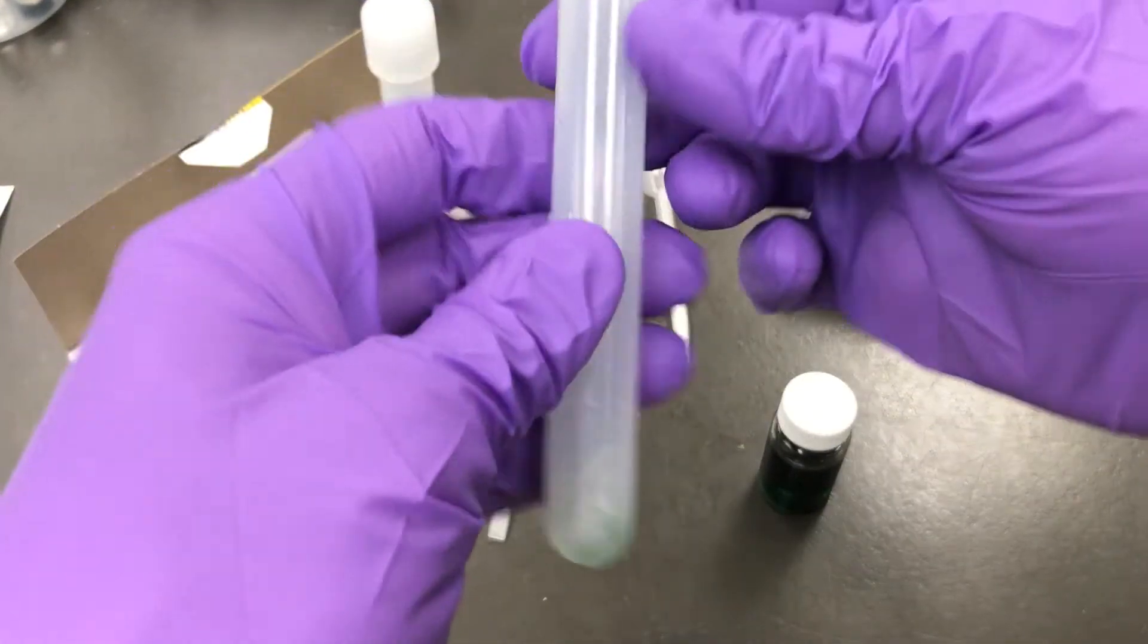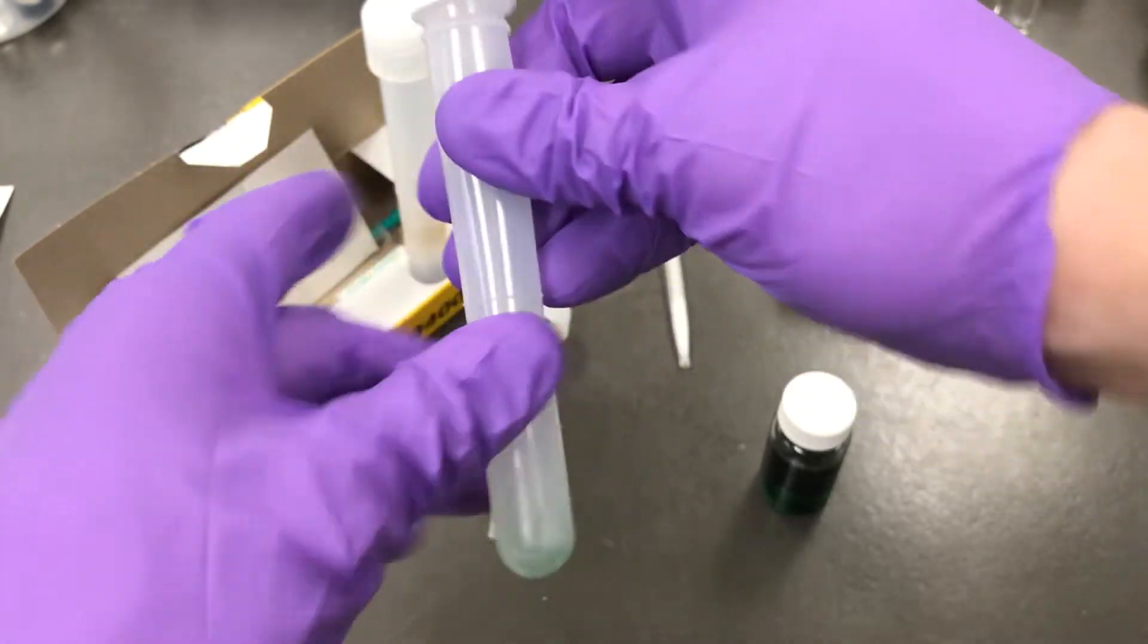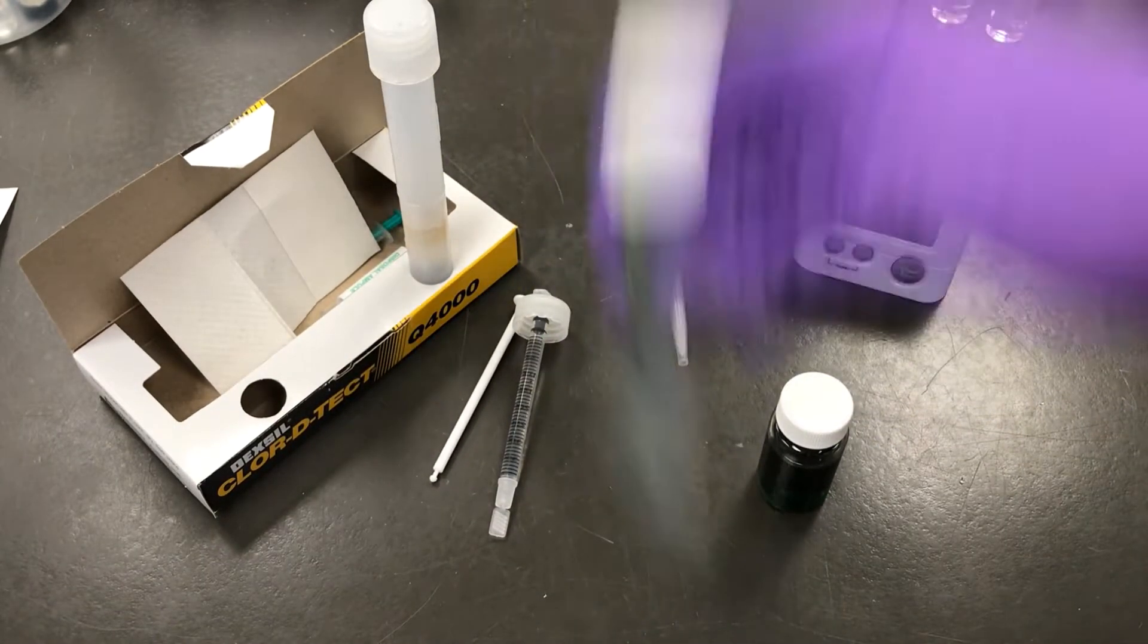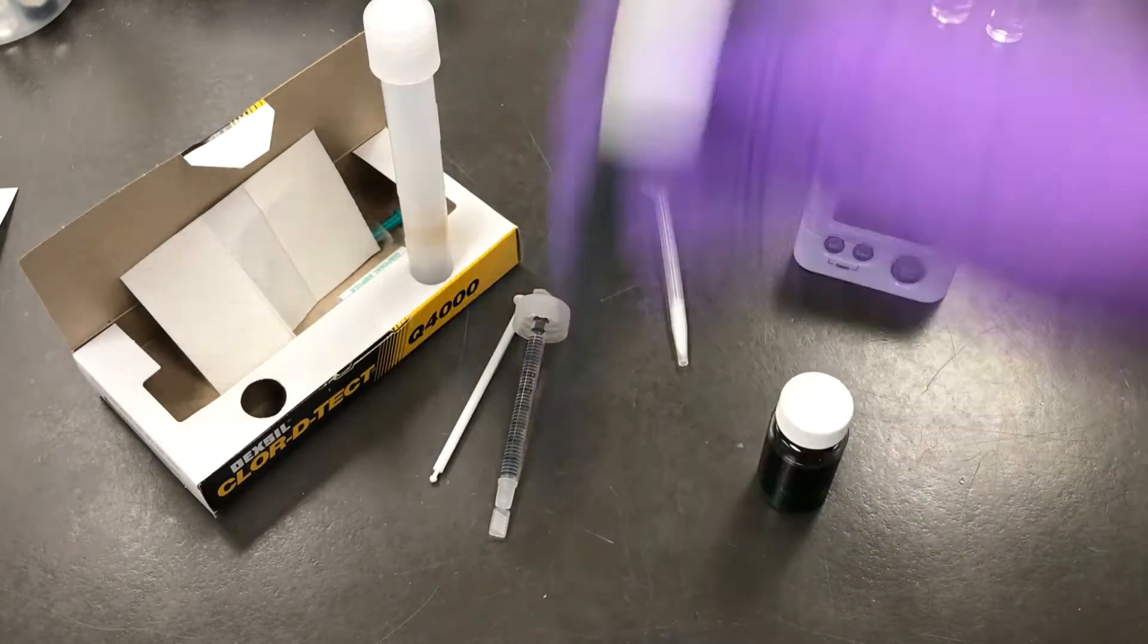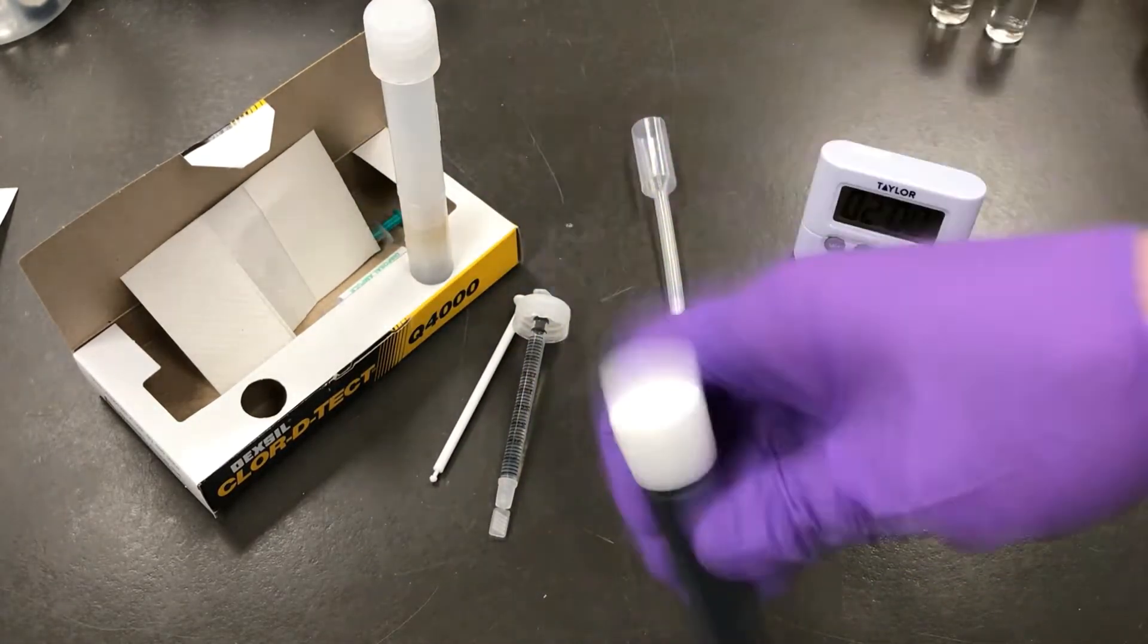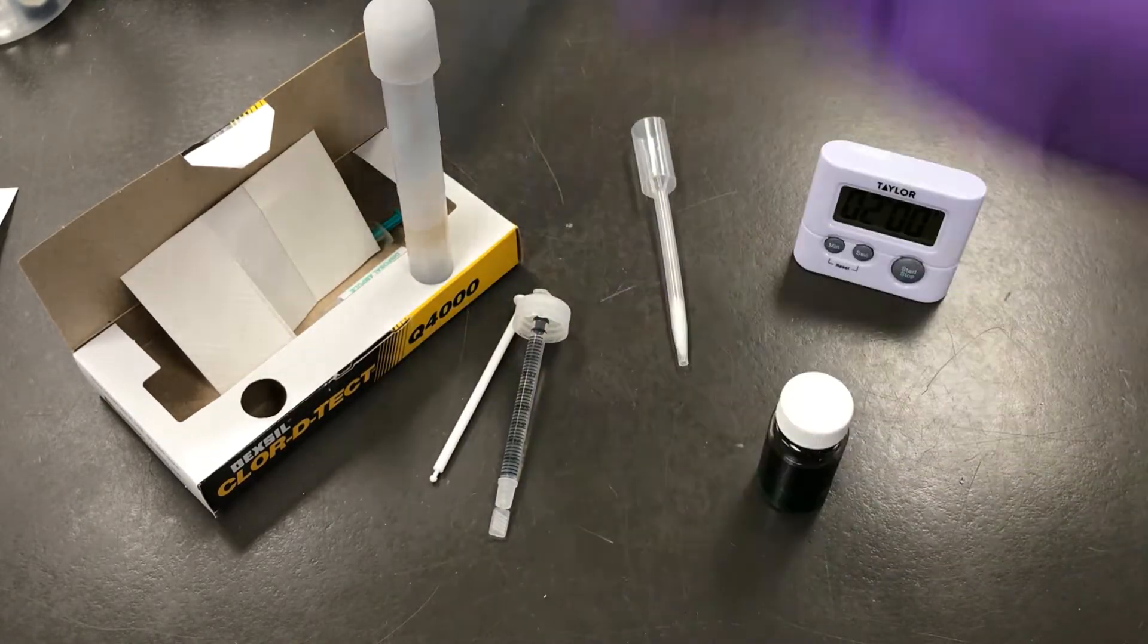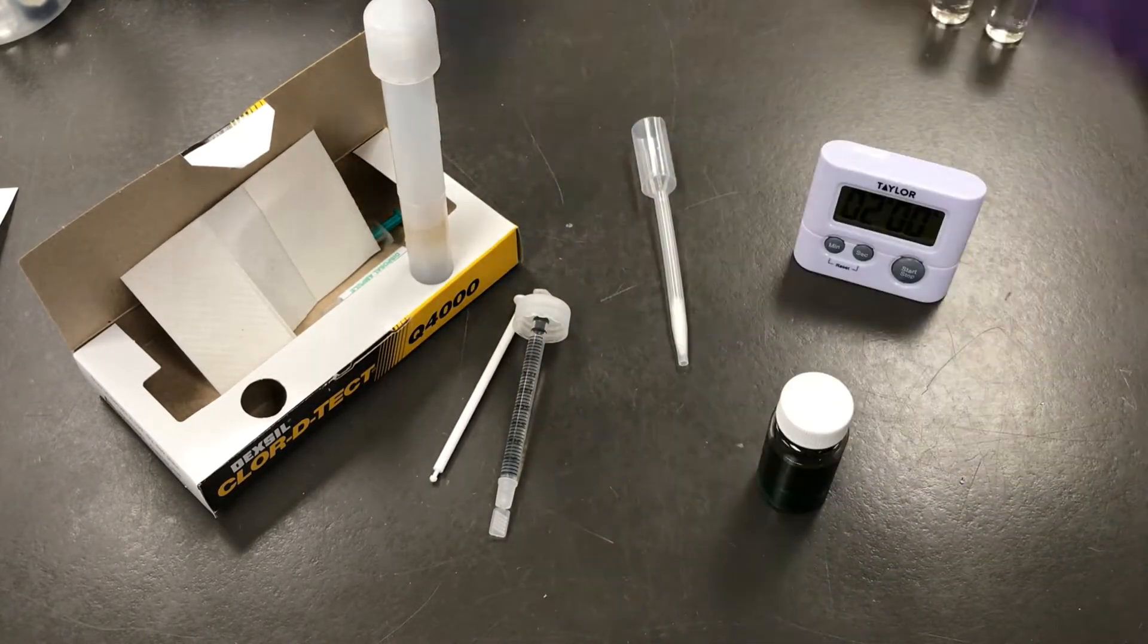Next, break the gray colored top ampule. Shake it vigorously for 20 seconds, then intermittently for 40 seconds for a total of 60 seconds. And you'll notice the inside of the test tube will be coated black.